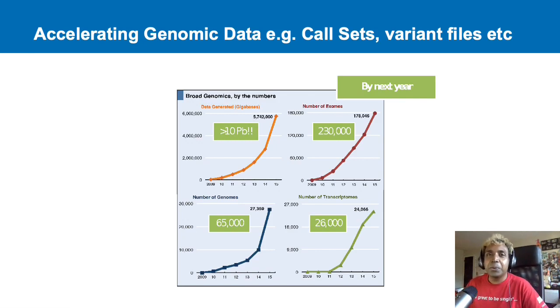Anyway, we saw how genetics started in the 1980s with candidate genes, tens and hundreds of markers, and moved to millions of markers. Now that we've hit the 2010s, these millions of markers per individual are in gigabytes. Per dataset, if your datasets are thousands of individuals, like the gnomAD dataset, which is probably a petabyte, 1,000 terabytes, a very, very large amount of data is generated.